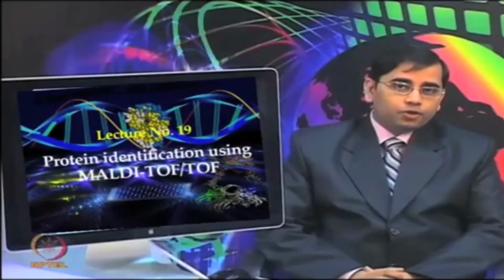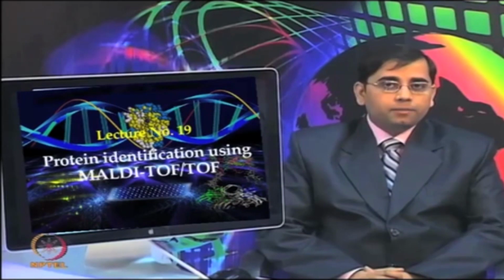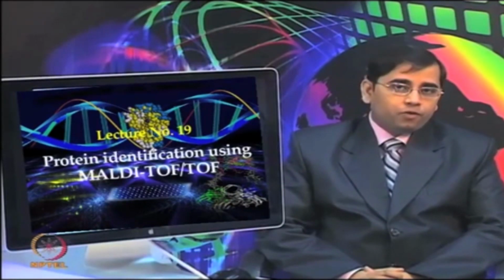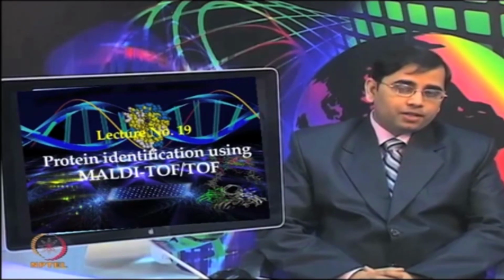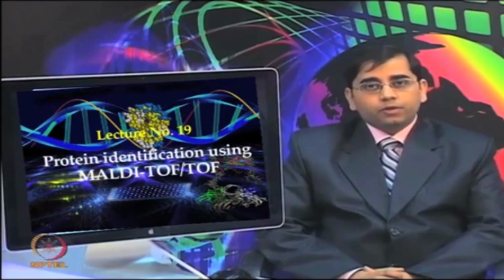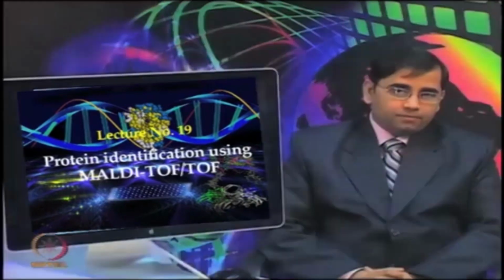So, today let us focus on MALDI-TOF, which is one of the very widely used techniques in proteomics. This provides a high throughput platform for several applications, including molecular weight determination, protein identification, as well as post translational modification studies.